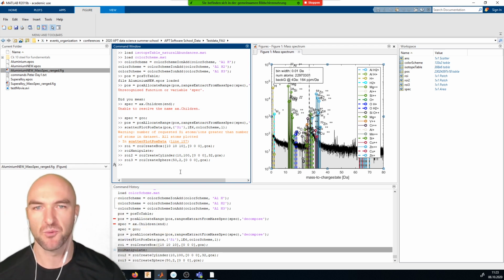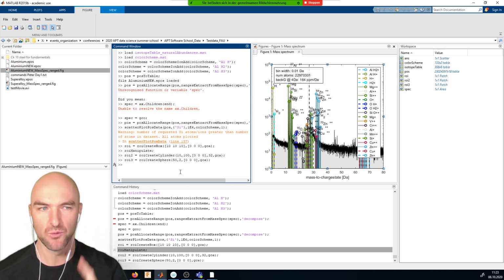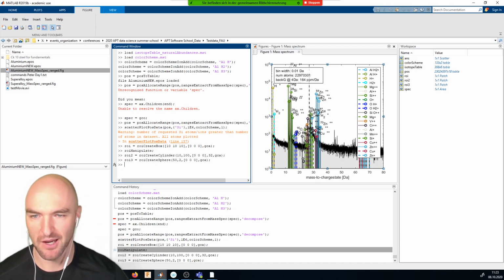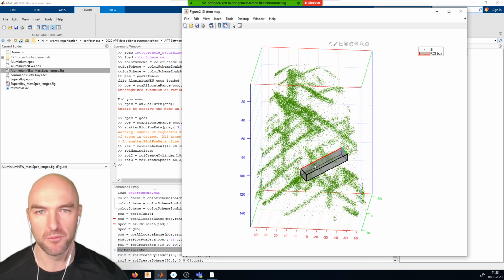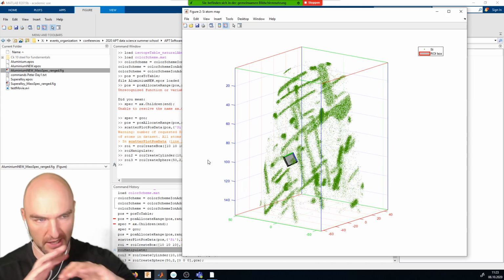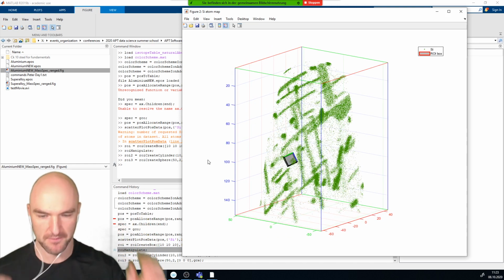There's different ways of doing containment tests, and we have two containment tests that are important for you. One is a so-called convex containment test, which means that essentially whatever object you want to use to say if something's inside or outside can only be convex.